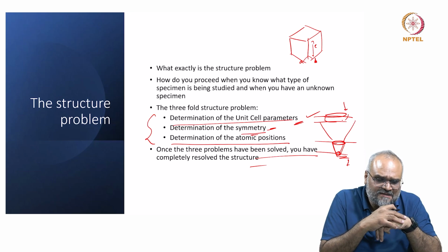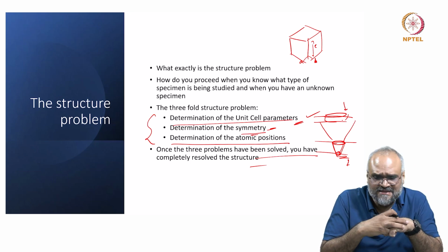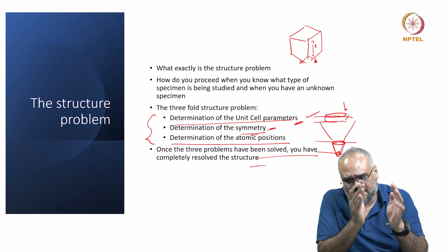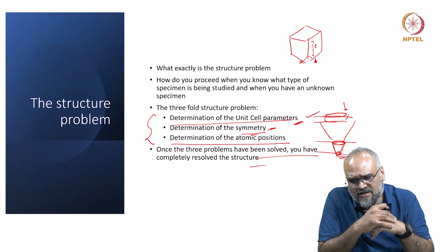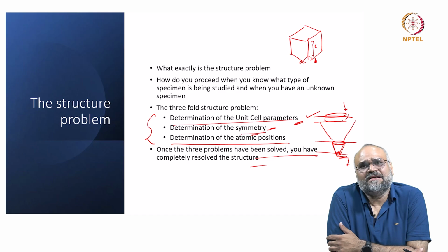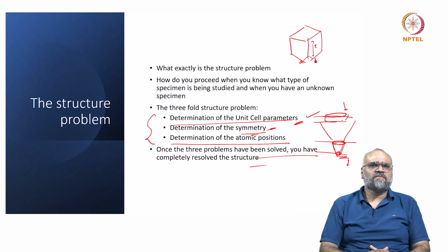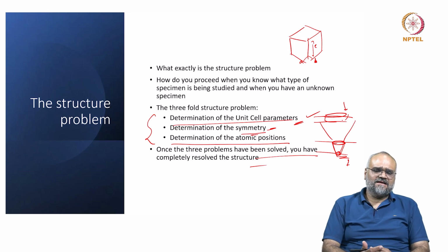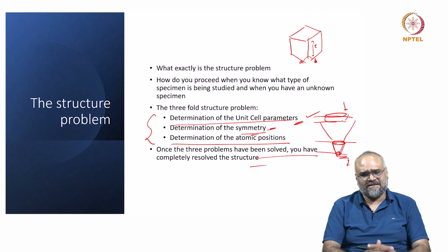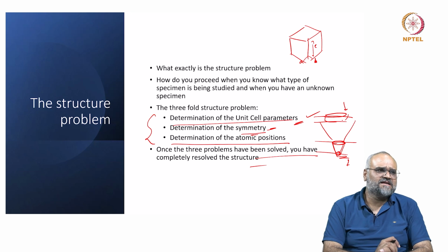I am not saying that only electron diffraction is better than X-ray diffraction or only X-ray diffraction is better than electron diffraction. As an end user, you should know for what sort of issues I should resort to electron diffraction and what sort of issues I should resort to X-ray diffraction. As an example, if I have a single phase material and I know how my crystal structure is, I am better off getting the idea of crystal structure by simply going to an X-ray diffractometer and getting the complete crystal structure solution from standard X-ray diffraction and Rietveld refinement.